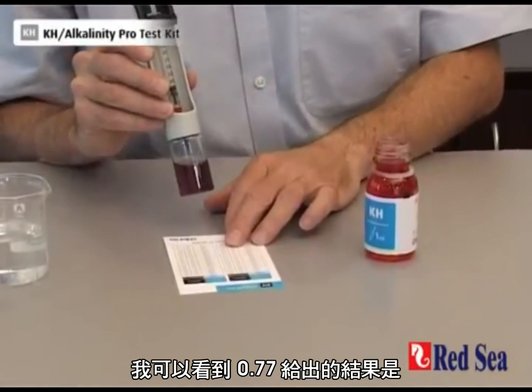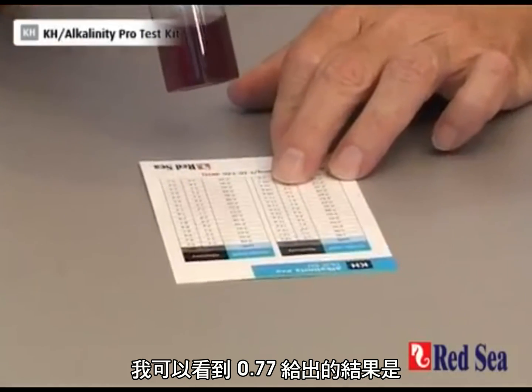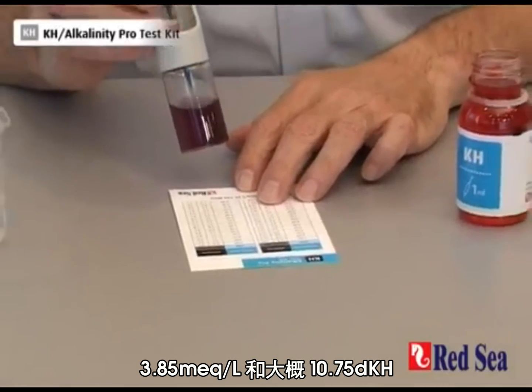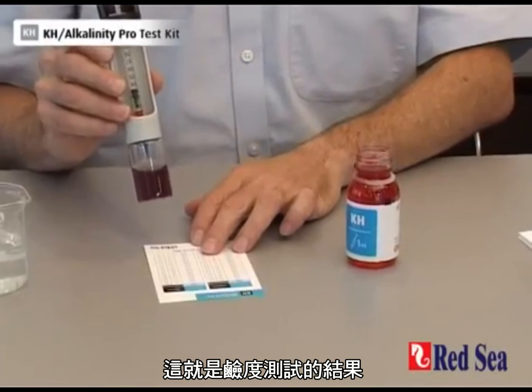I look at the card and I look for 0.77. I can see that that gives me 3.85 mEq and about 10.75 dKH. And that's the end of the alkalinity test.